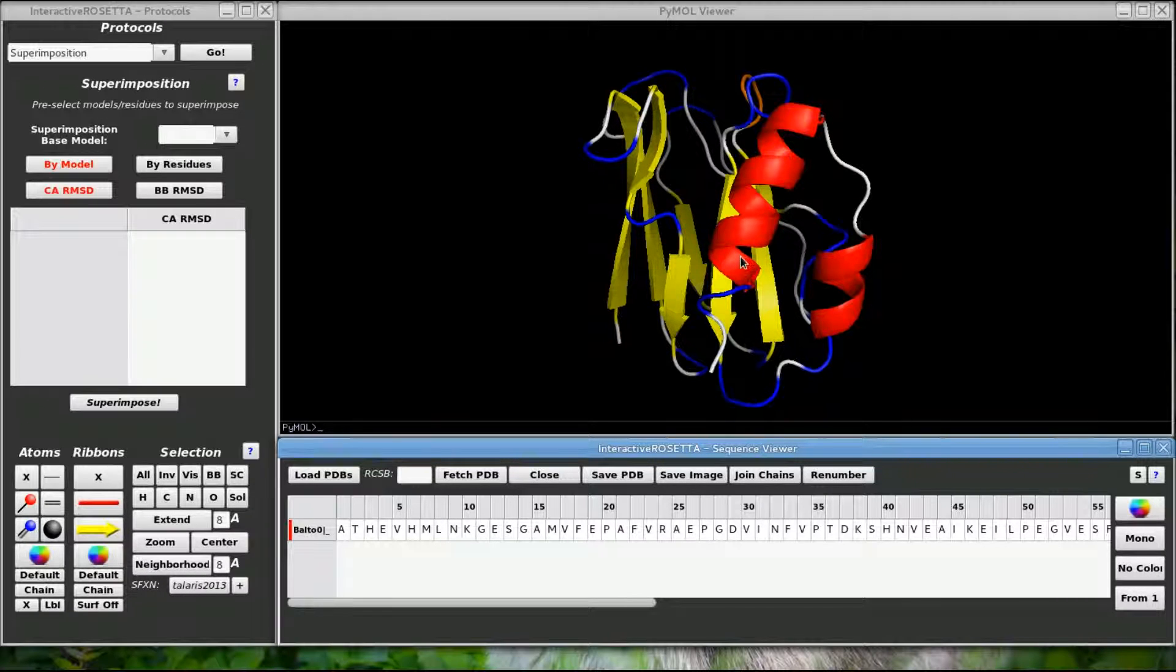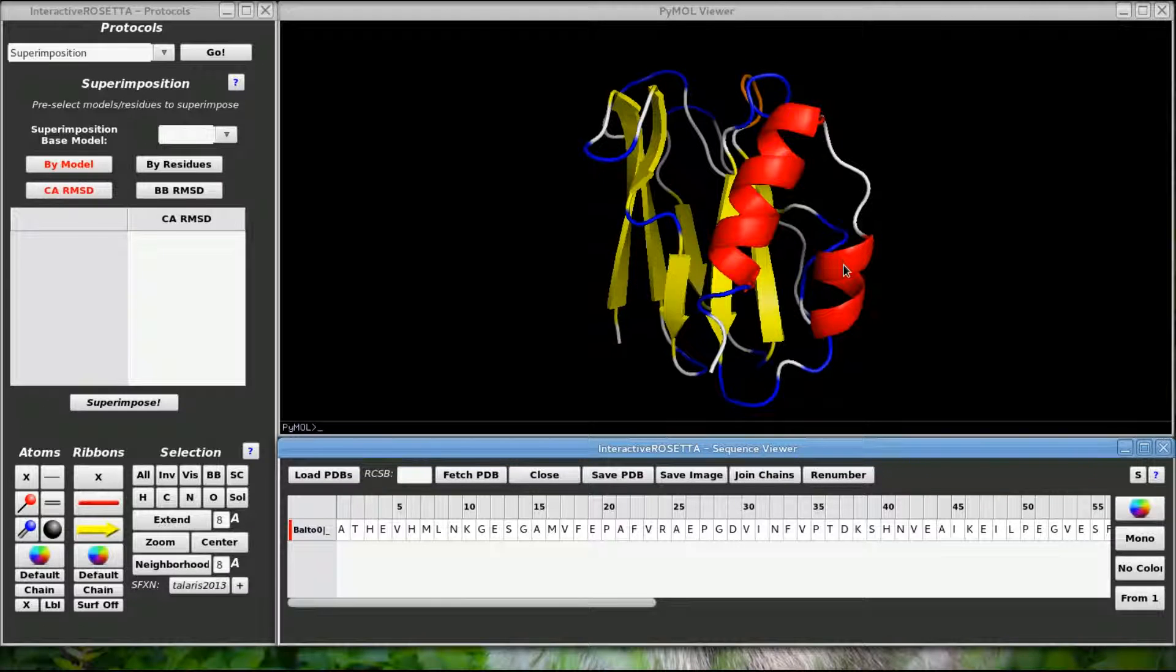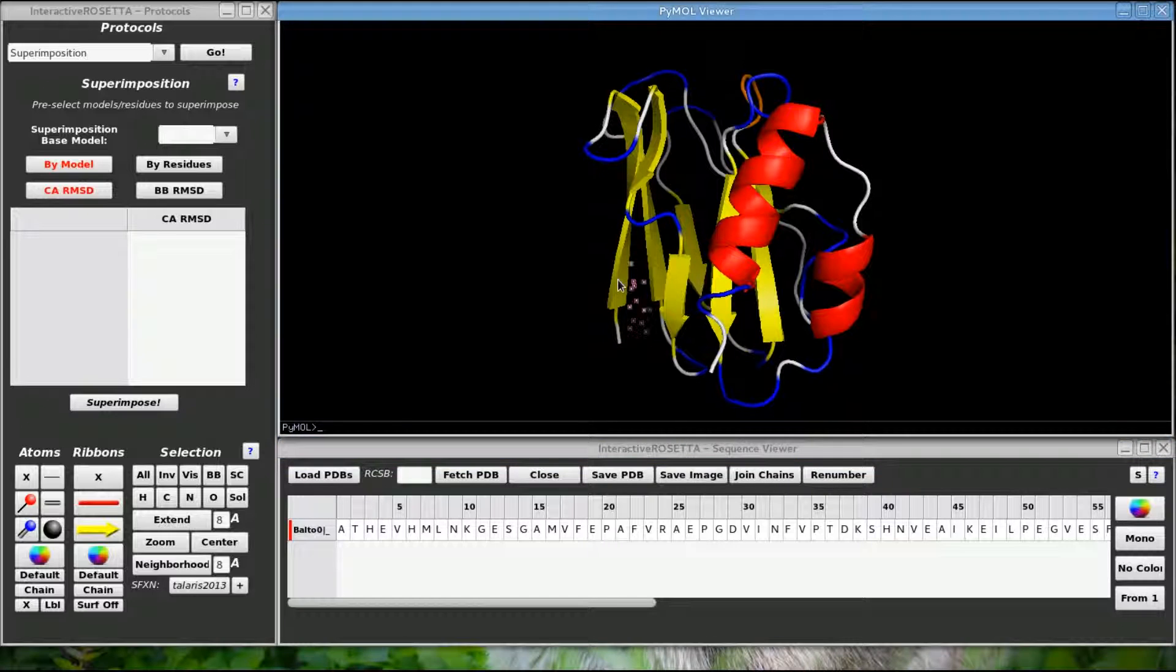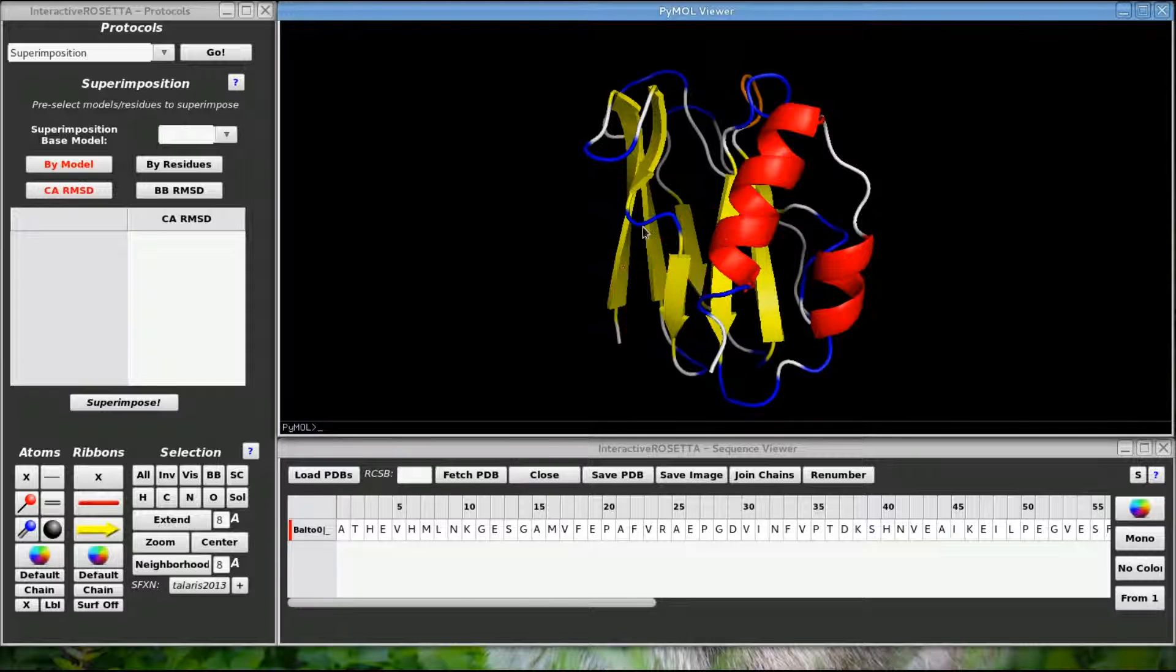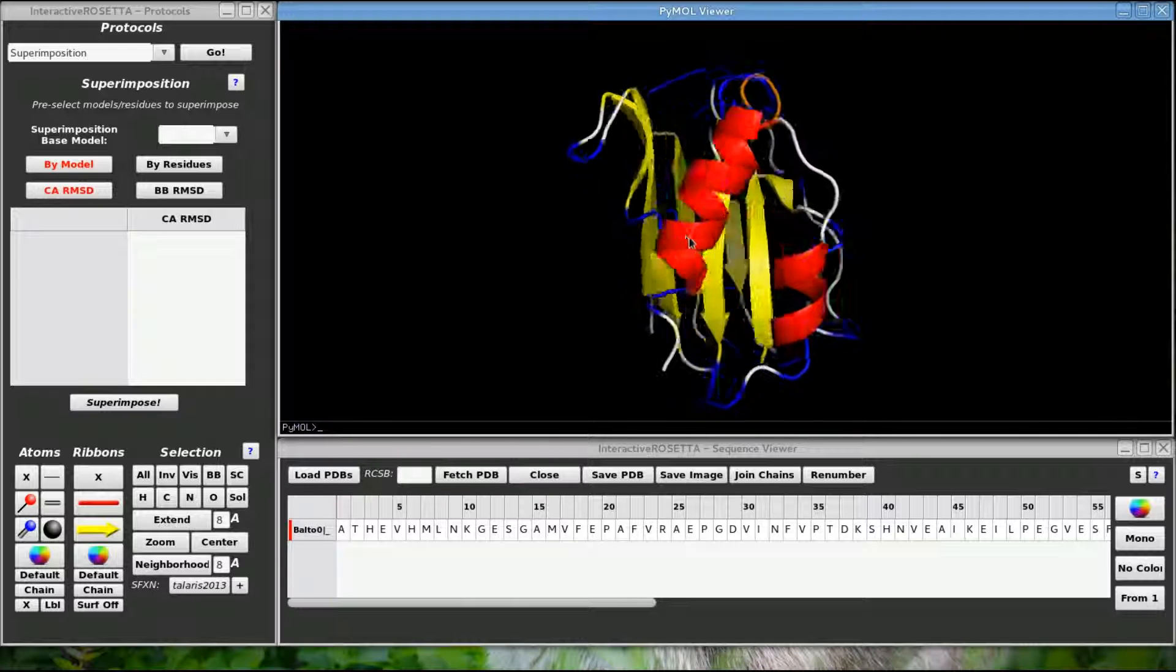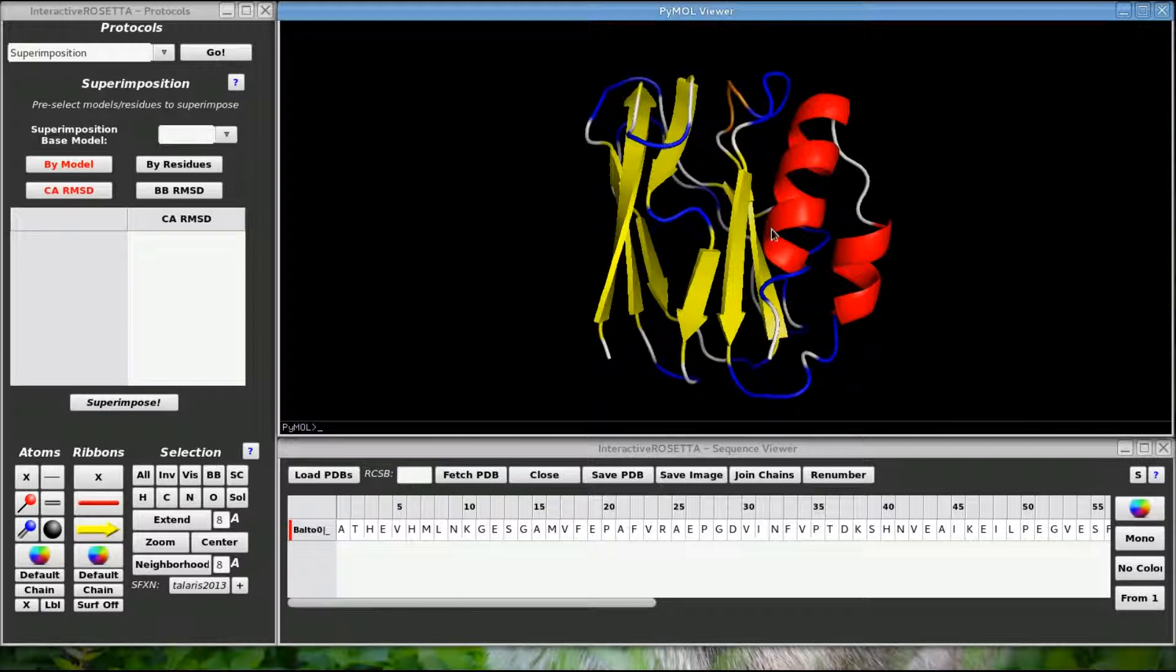You can see that the structure is now viewable in Pymol. The default display hides all of the atoms and displays secondary structure in cartoon view. The coloring comes from DSSP. If I use the left click I can select residues in this structure. Left click, hold, and drag the mouse to rotate the structure.